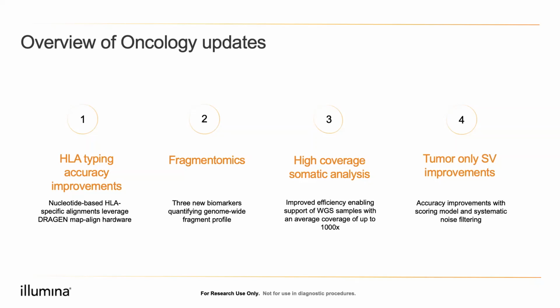So this is an exciting update for somatic whole genome analysis. Then for the tumor-only structural variant caller, we've got a couple of improvements. So we have a tumor-only scoring model.